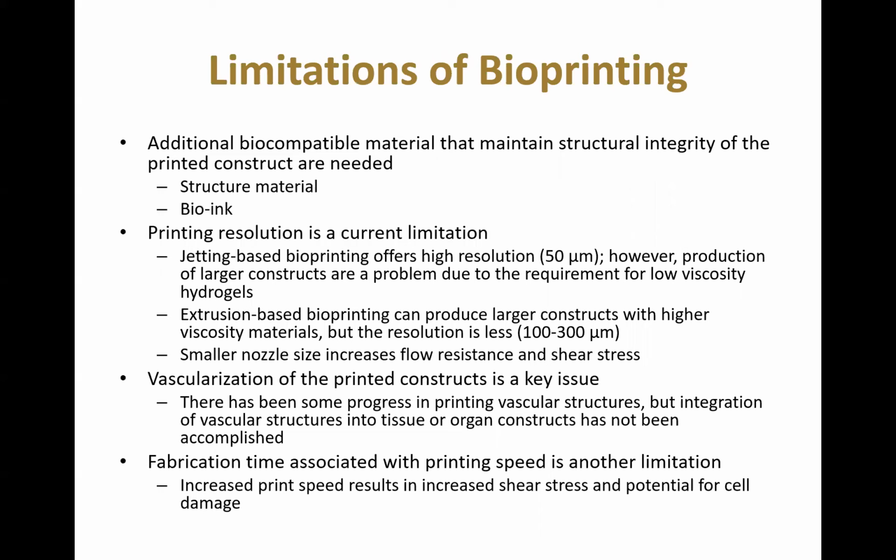So I'd like to leave you with some of the limitations of bioprinting, though. We really need more biocompatible materials, both structural and bioinks. There are some problems with resolution that we need to address, as well as vascularization of larger printed constructs, which is a challenge, and a large number of investigators are working on that now. And also fabrication time. We really need to decrease the print time to be able to maintain cell viability from the very beginning to the end of the construct.